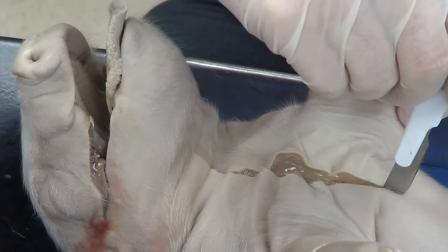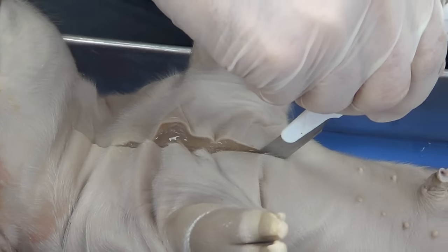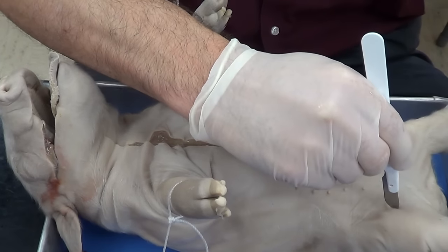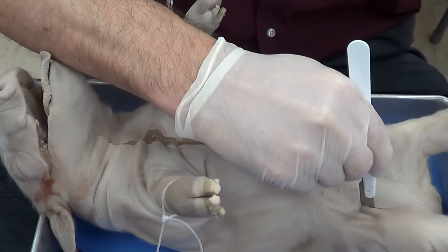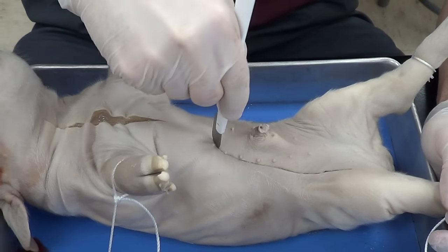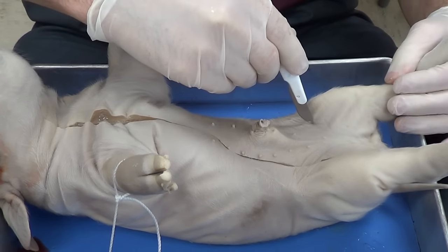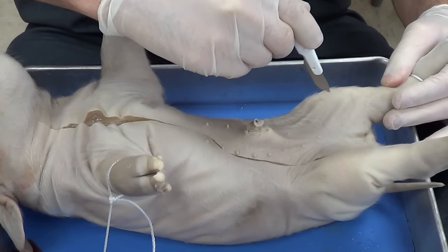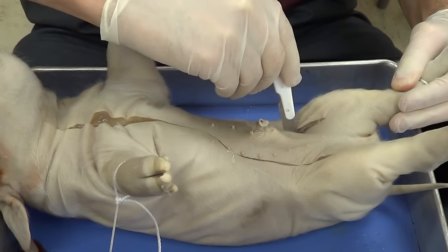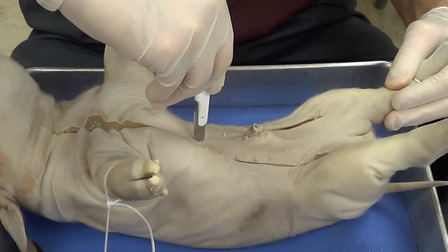Now I'm going to move — you would want to turn your tray to make this a little bit easier for yourself. I'm going to cut down through here and cut around the umbilicus and up. I'm going to come down here near the lower extremity, cut around the umbilical cord and then up.